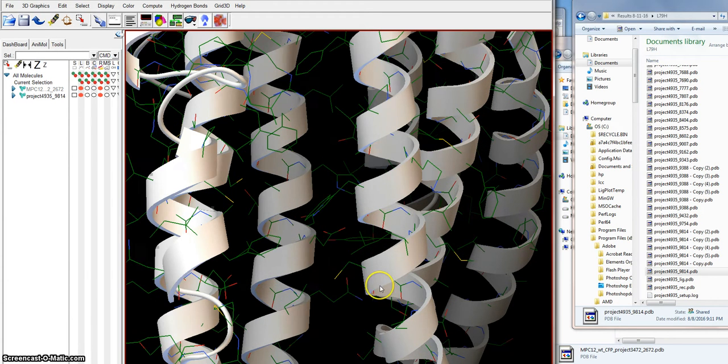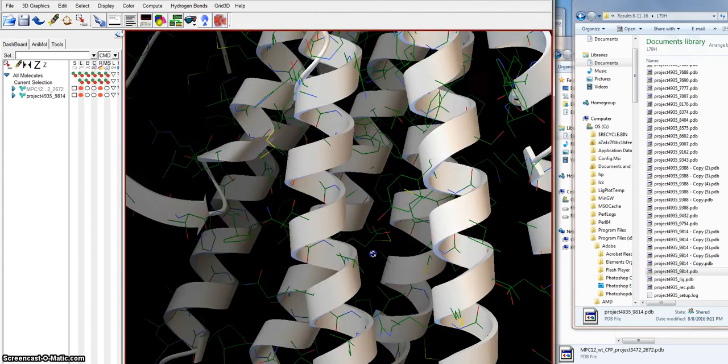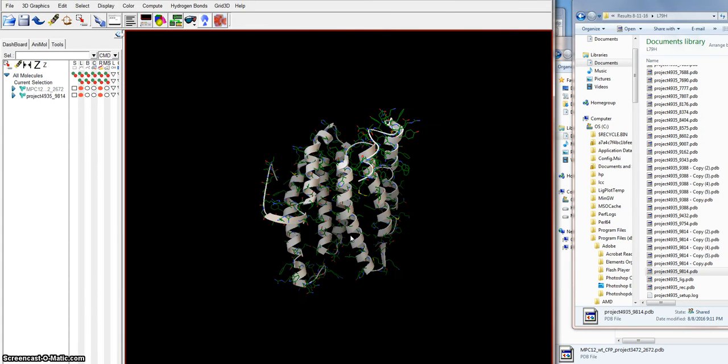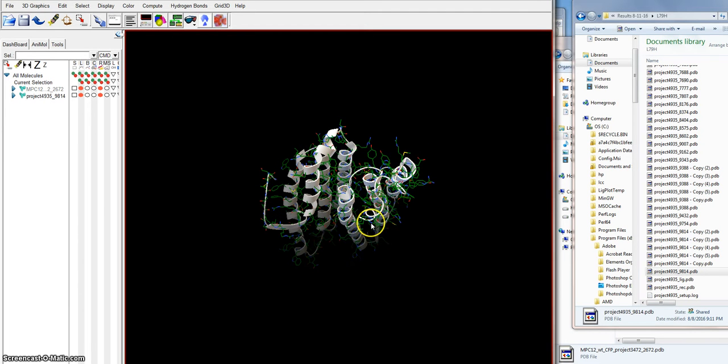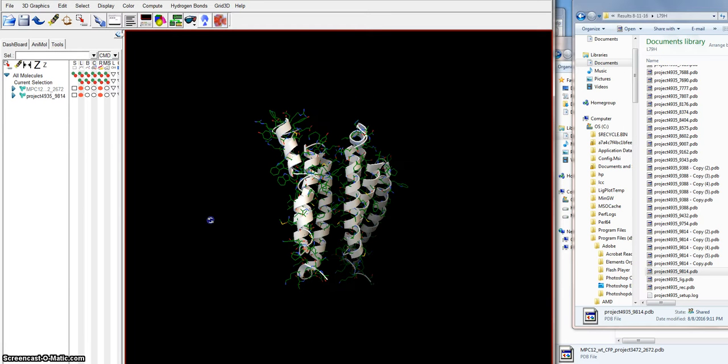So here's the Cys on MPC2, right? And there's the 60 and 61, but over here on this helix of MPC1, we don't have the Cys residue. It's over here on the opposite side. So the problem with this one, and it was the case for any of these best fits, is we have an inverse arrangement of the MPC1 onto the MPC2. So I really didn't find a best fit for any of these.